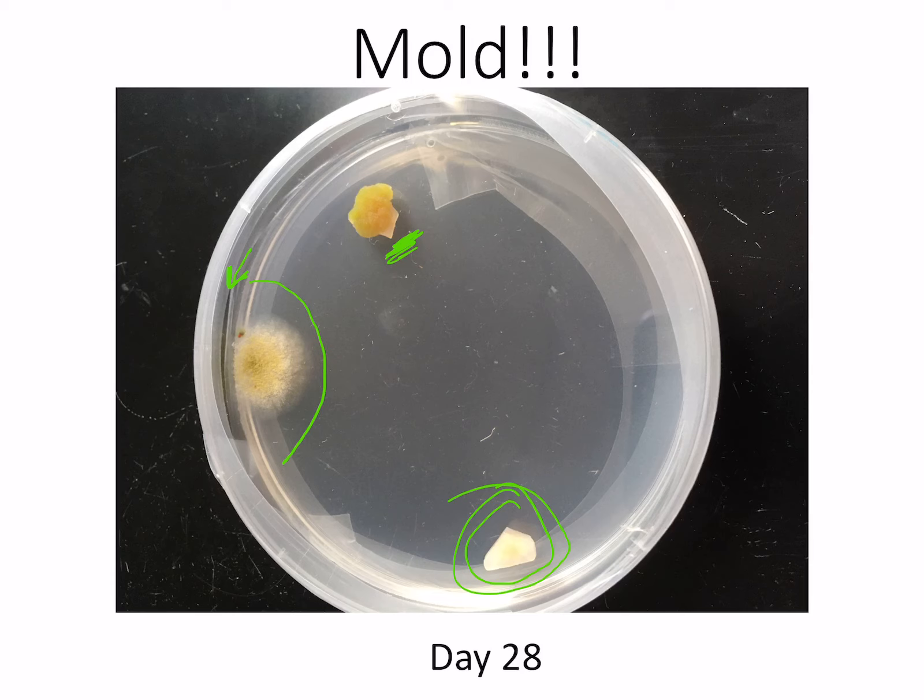I think the mold snuck in from outside. That also tells me that the other experiment — the one with the test tubes — had all failed. Perhaps if I had parafilmed them, they wouldn't have become contaminated.